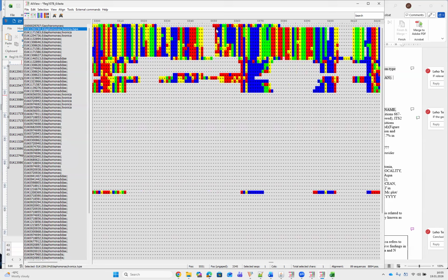We can also think where to start exactly. Where is the strongest distinction between all? So this is 23. These additional C and A are very constant here. This G is more variable. So maybe let's focus on this part instead.